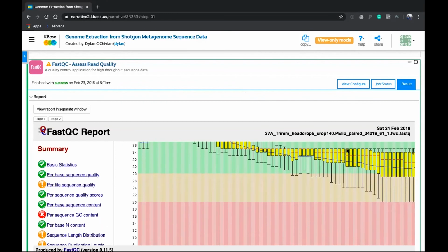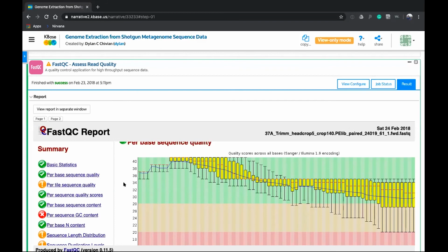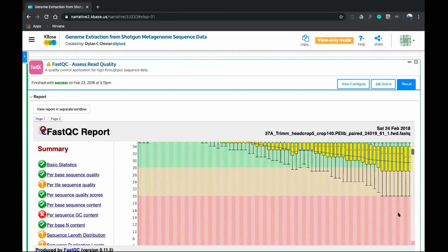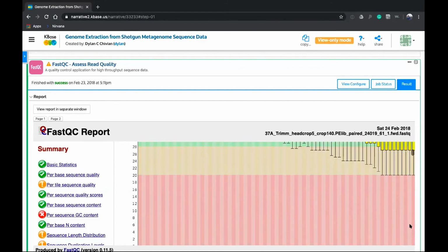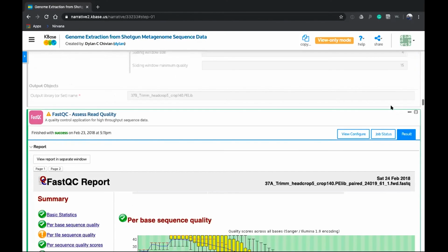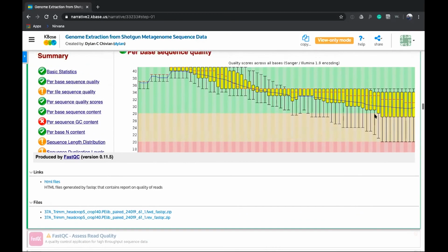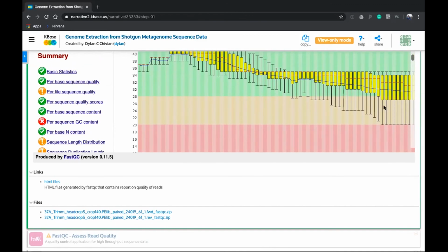This is the error profile based on the FastQC assessment, and it highlights that across all of the Illumina positions we have overall better quality, and it seems like that's because we've trimmed at least the 15 base pairs off the end of the molecule here. So there's an example of how using read QC tools gives us better reads to work with downstream.